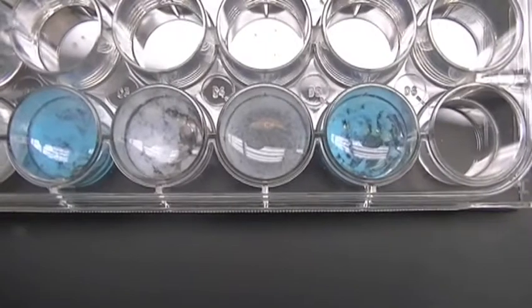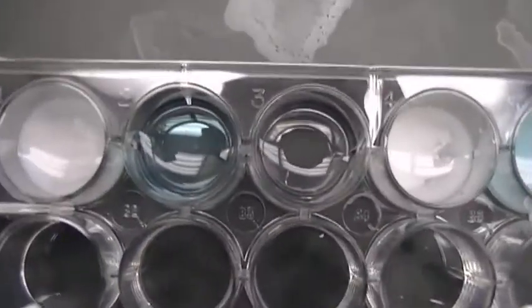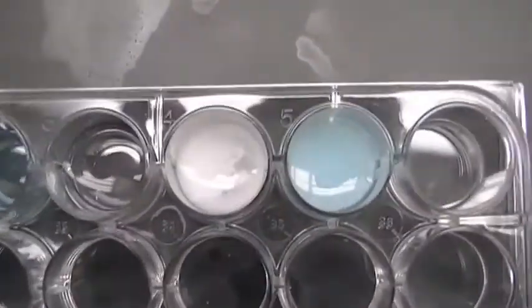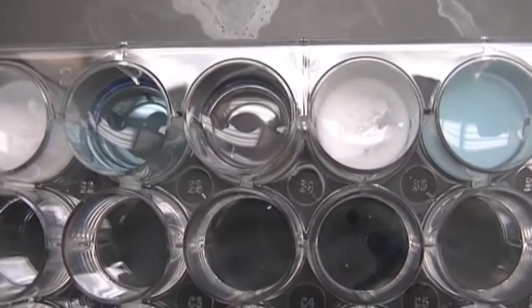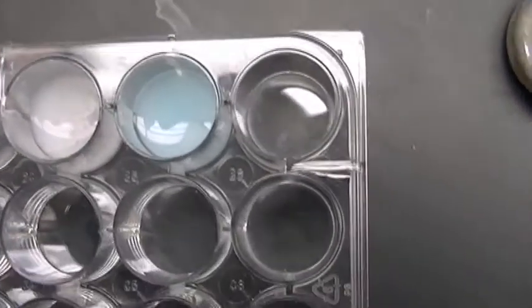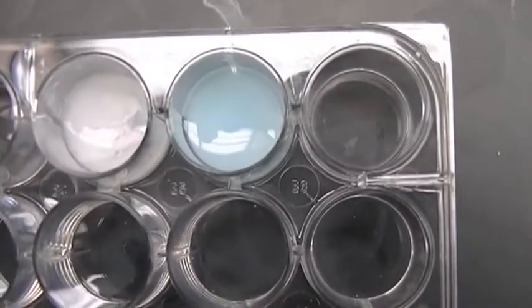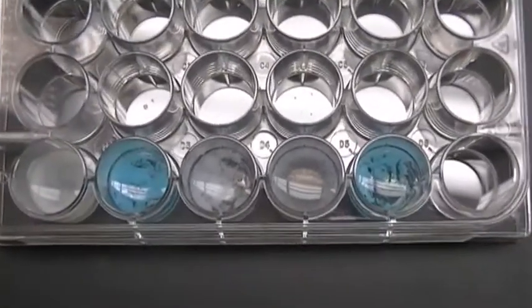This is with the ammonium hydroxide. All of them have a precipitate in them. And then with your HCl, you have a precipitate in the first one. The next 2 are clear, no visible reaction going on with those 2. And then you have your precipitates in the last 2. So I think it's easier to see it with a black background.